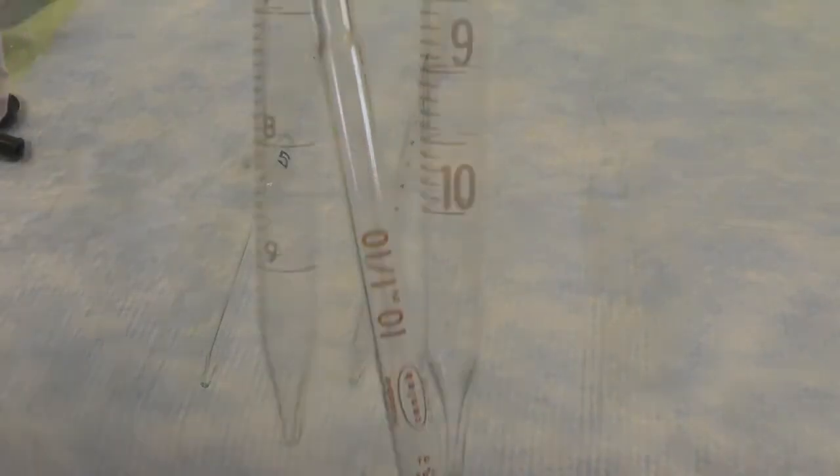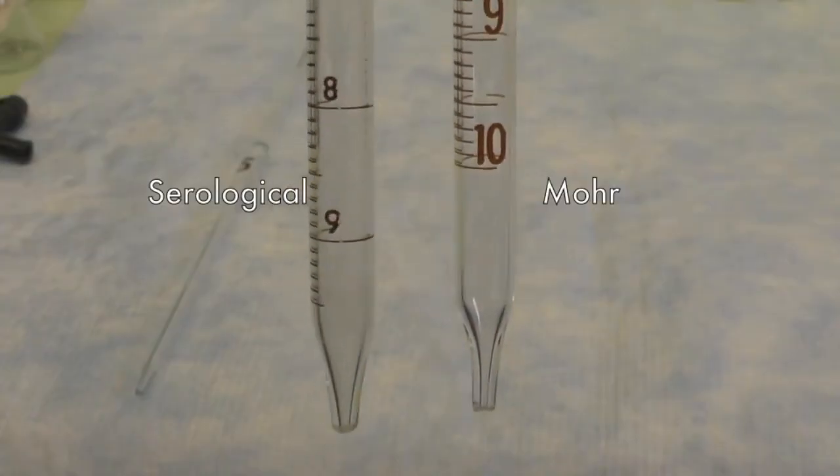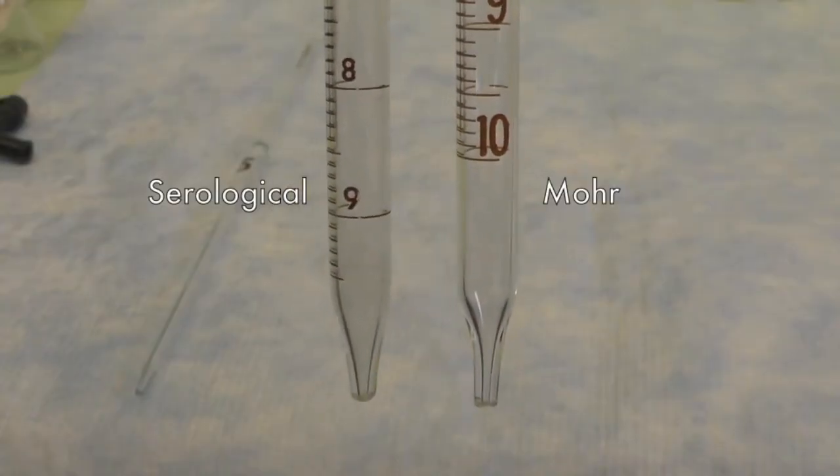Mohr pipette is very similar to serological pipette, but an obvious distinction is the position of the graduation marks. Serological pipette has graduation marks all the way to the end of the pipette, while Mohr pipette has a baseline mark, such as 10 milliliters.